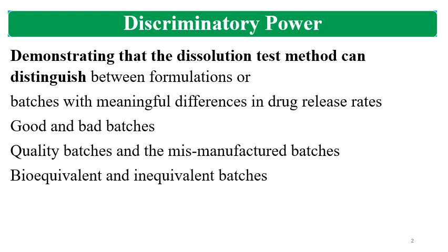Now good batches are those which are in line with the batches which underwent the clinical studies or the bioequivalence studies, and bad batches are those which are not meeting the dissolution criteria as per the bioequivalent batches.